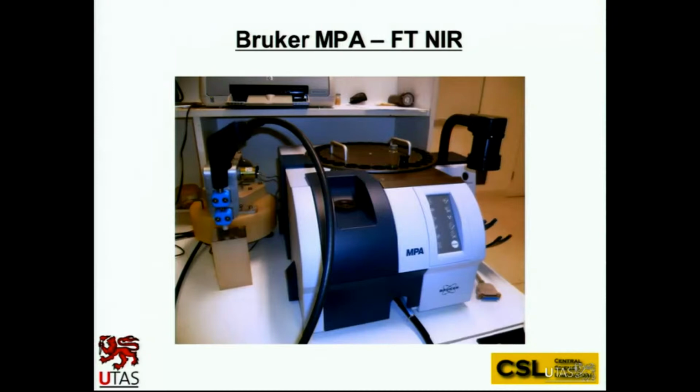And this is our near-infrared spectrometer. So for example, what you can do is this is crushed up grass, cattle feed in a glass vial, and we can simply measure the near-infrared spectrum inside the vial. So through the glass, the light comes through the bottom, it scatters back to the detector, and that's how we measure it. So you never have to even get the sample out of your vial. And that's simply something you could not do in infrared.